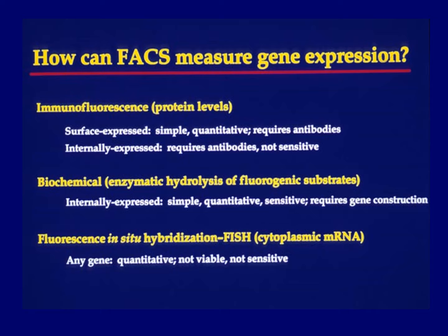and now sold to BD, and BD now has it as a part of its operation. So a lot of the antibodies do come still from the Pharmingen division of BD, Becton Dickinson.